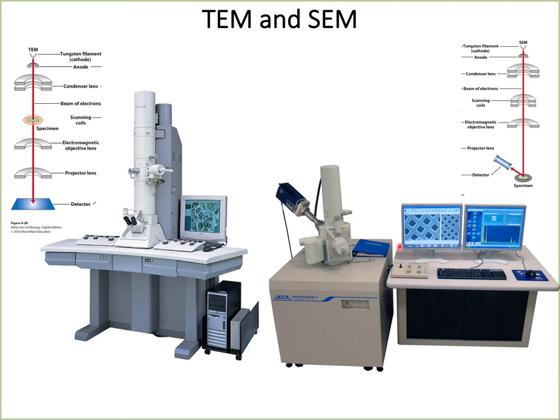On the other hand, here you are looking at a typical scanning electron microscope. The sample holder is right here, and you have to put the sample in. Here you have the electron source, and it is usually much smaller because you need less voltage or electron beam for scanning electron microscopy. Here is the detector, which is at an angle. From here, the image is detected through the camera using this detector, and it will be visible on the computer screen.